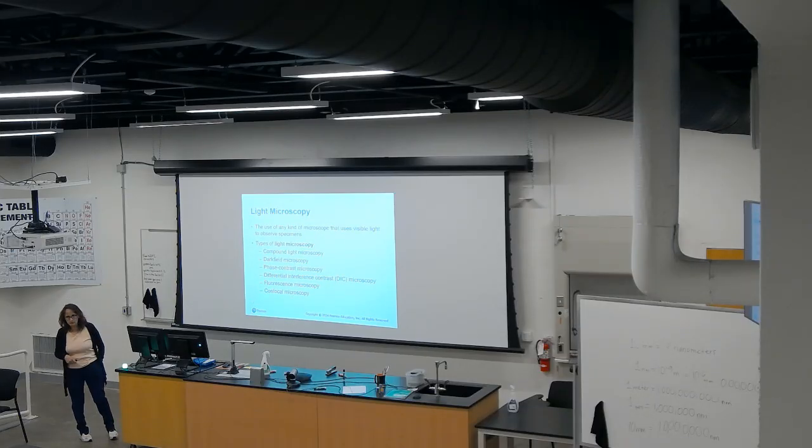And then the common type of microscope that is used in academic settings is the light microscope. They have different categories, including compound light microscope, which is the one that we use in the microlab, dark field microscopes, phase contrast, DIC (differential interference contrast), fluorescence microscopy, and confocal.